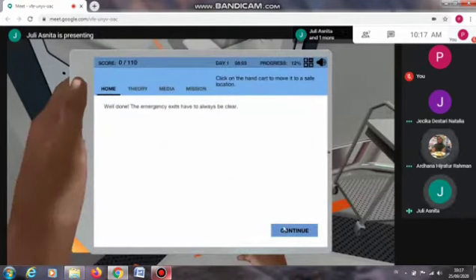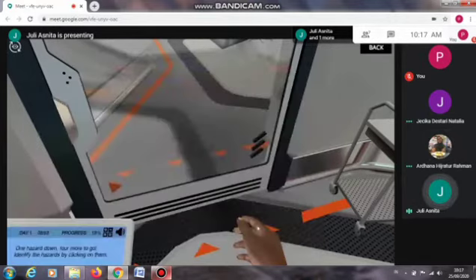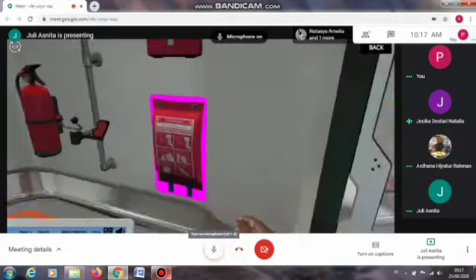Oke, continue. Hazard pertama selesai. 1 hazard down. Cari yang kedua. 4 more to go. Identify the hazards by clicking on them.